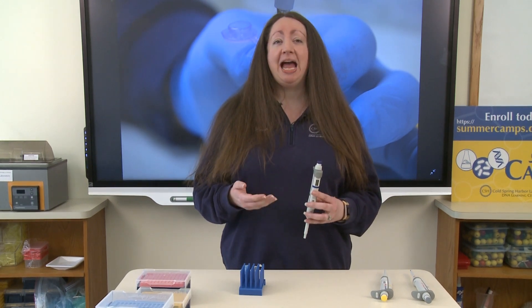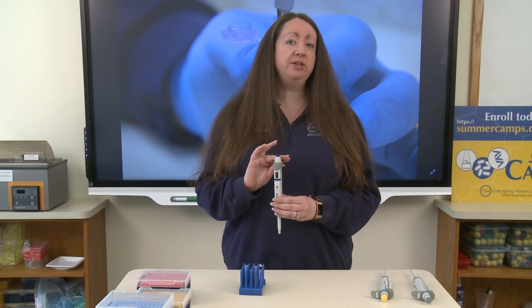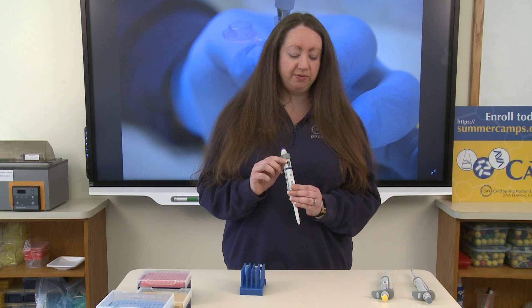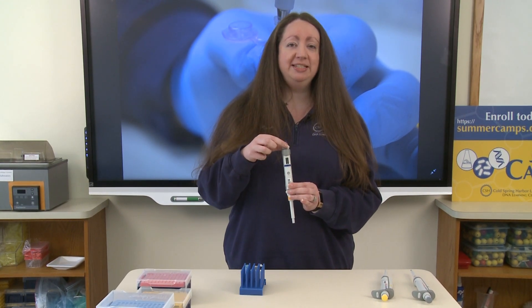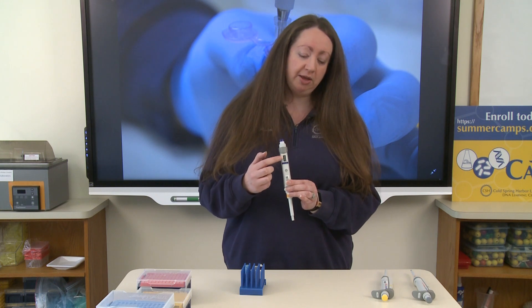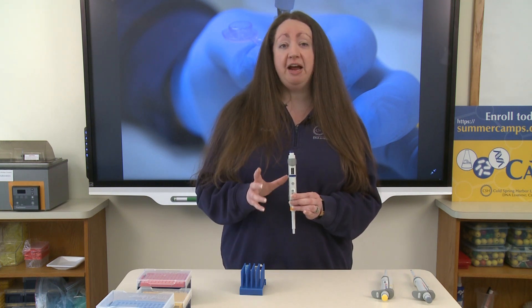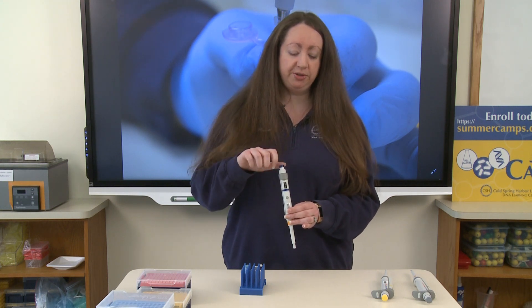I'm going to show you how we measure and transfer volumes of liquid using these micropipettes, starting with the blue micropipette, which measures our largest volumes. To set the volume of liquid you would like, you're going to use the dial on the top and look in the window on the front of the pipette to confirm the correct volume. I'm going to start with a volume of 250 microliters.